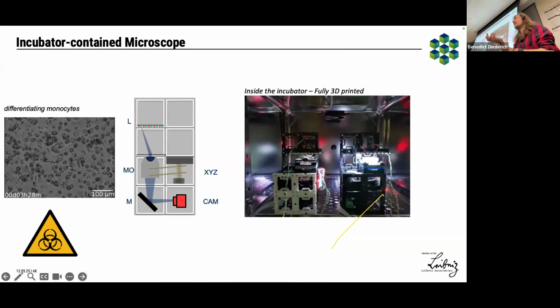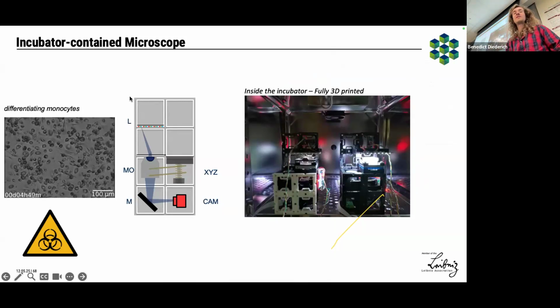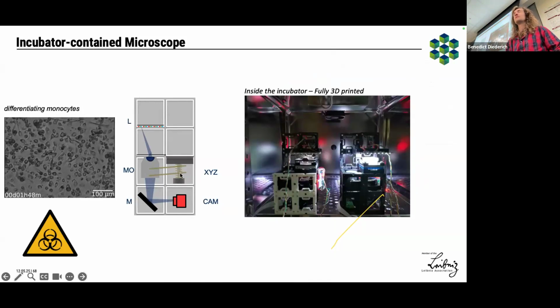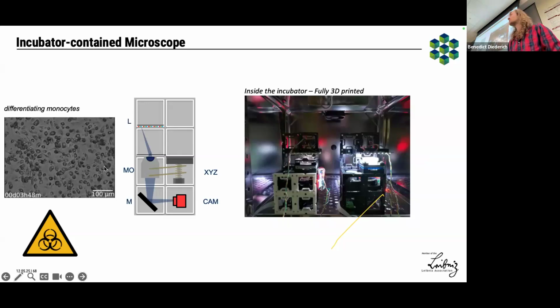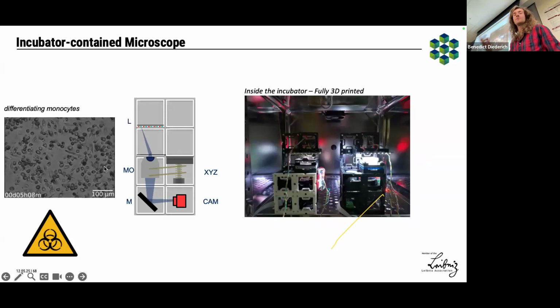So I have an idea. I want to have an inverted microscope, how would I do it? So of course you need to have an illumination. You have to have an objective lens, maybe a folding mirror, and maybe a camera. And maybe something that is moving the Z position of the objective, in order to focus it. And then you can, for example, use the Raspberry Pi Zero to just take time-lapse images or whatever.